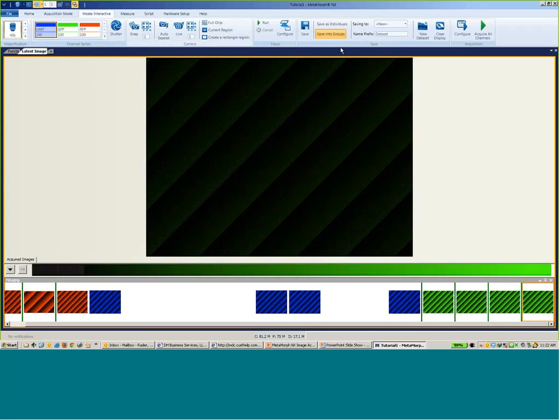Okay, multidimensional mode. So again, it's a left to right workflow. Select your objective, set the number of channels. So you click on the box, hit add channel. We'll do, say, a 4 wavelength. We'll come in and do our blue or green, our red, and our DIC.